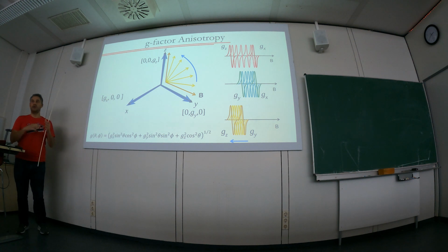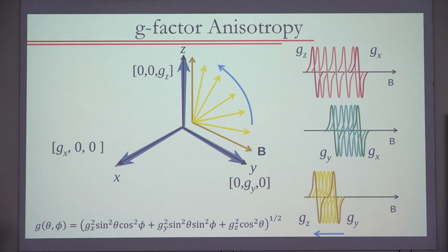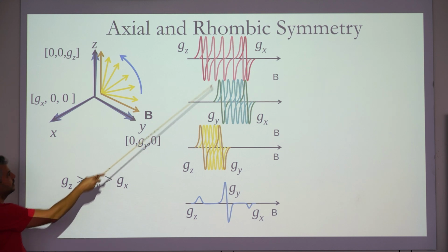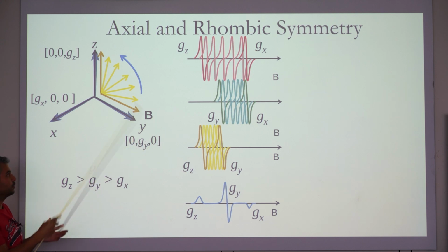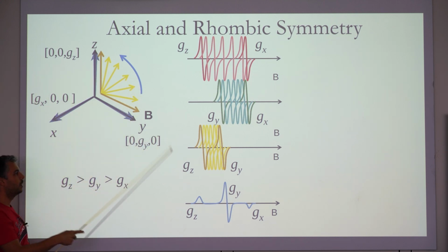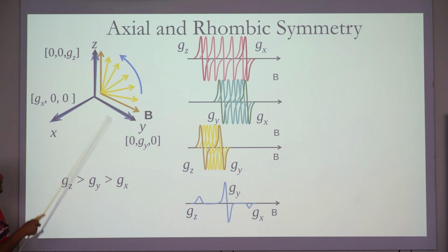So when you do a powder spectrum, you're actually sweeping in all planes, not only these 3, but this is an example. When you sweep all of them, you get contributions of all possible resonances for all possible orientations of the magnetic field to the total spectrum. So if you add up this plane plus this plane plus this plane plus all other planes, these 3 are enough to tell you which are the values, but then you have all the other planes that are being summed up. It's not that you sum them up. The experiment is summing them up because you have molecules in all orientations.